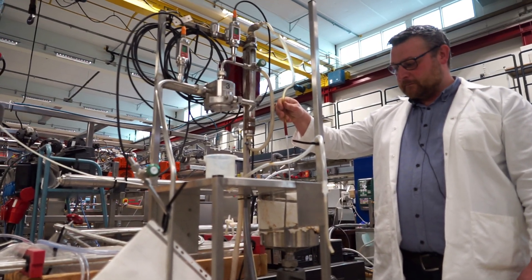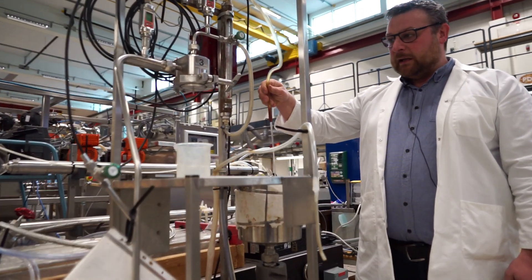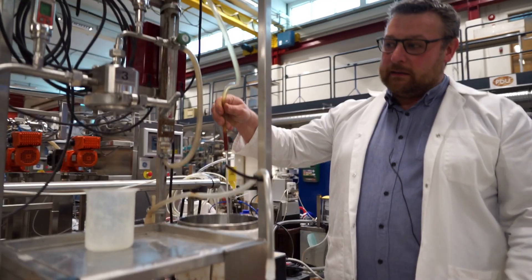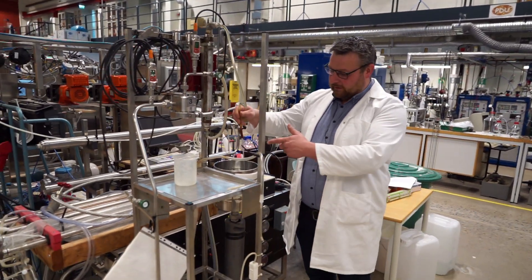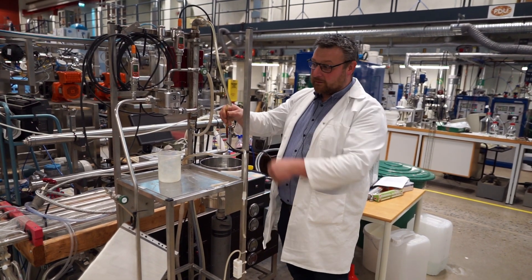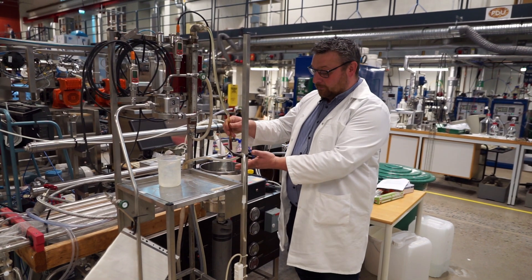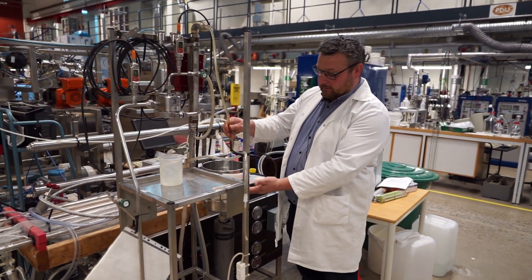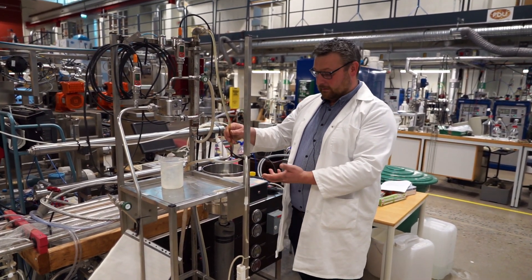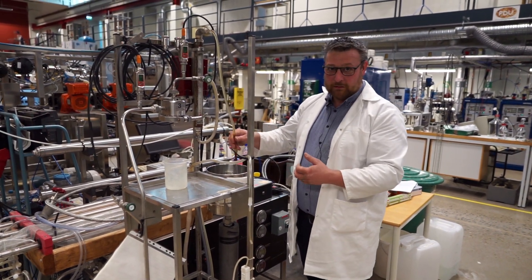And that's why we have the circulation, right? And that's the reason why we have recirculation. Yeah. It will take us, at this rate, to reduce the volume of this by 50%, it will take us a couple of hours. But if we now have a valued product here that we want to concentrate, we will then have it at a higher concentration after a couple of hours. Yeah.